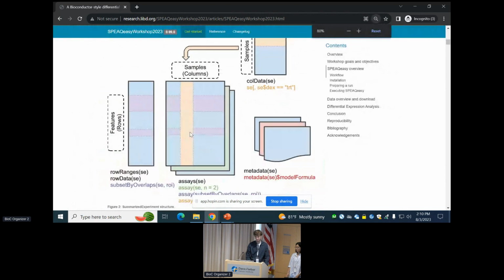Which aligner do you use, before you jump in? Sure. We use HISAT2, which is the default. We also support STAR, if you want to use STAR instead. We have tutorials on how to swap out tools. It's a bit experimental, but those are the two that we support right now. Those are built in now.